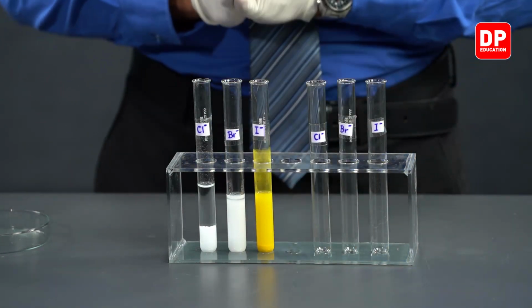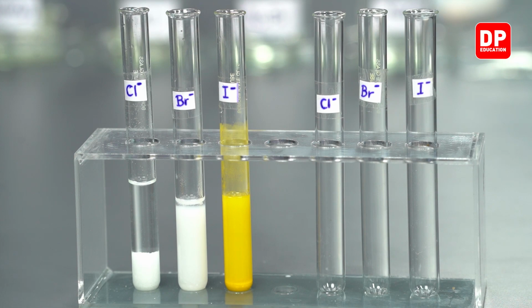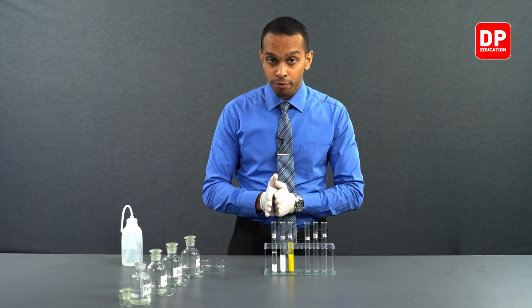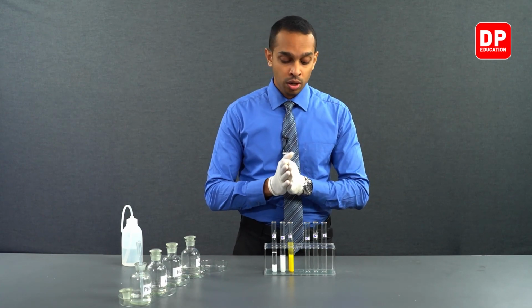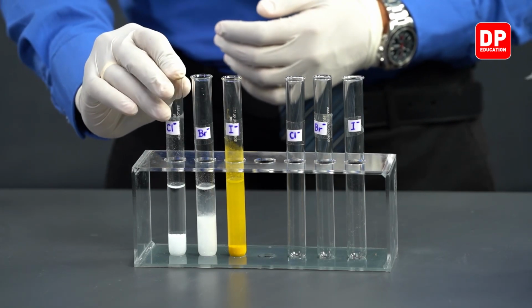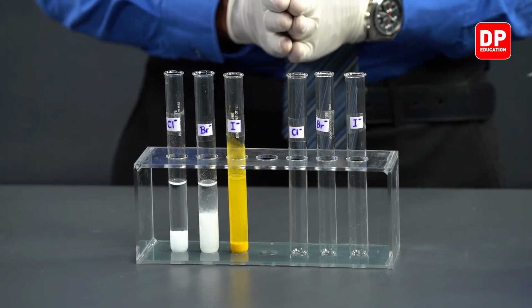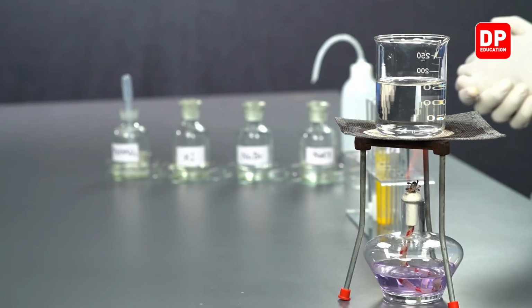Now, we want to see if these precipitates are soluble when we heat them after adding a little bit of water onto them. So let's separate some of these precipitates into a different test tube, and let's try to dissolve them by heating them. Now let's start mixing these precipitates again and separating half of it to a different test tube, because we will be trying to dissolve these precipitates by heating them with water.